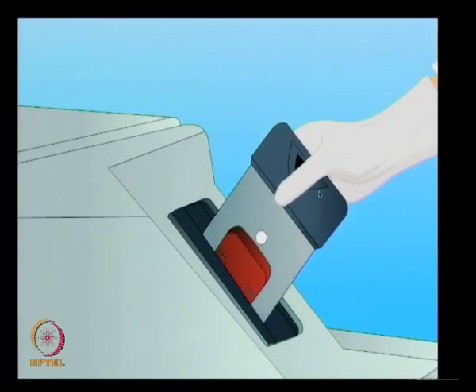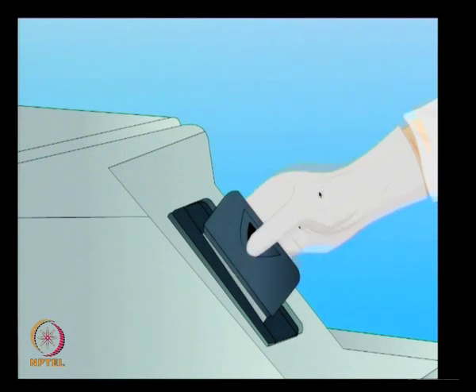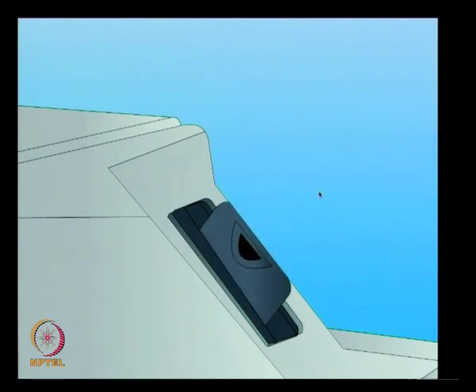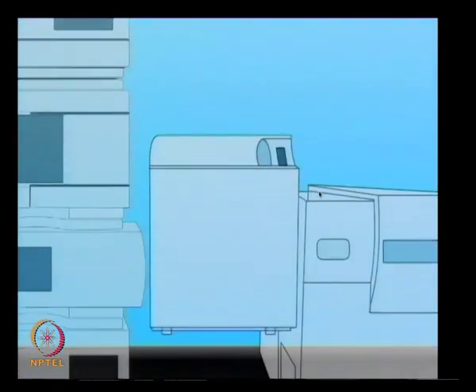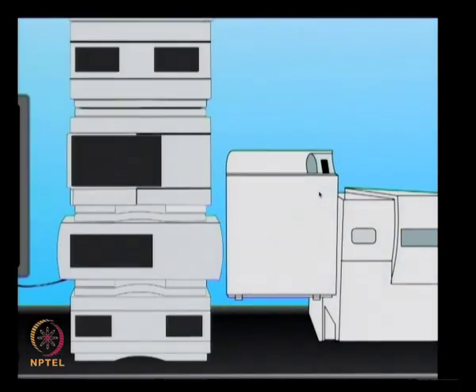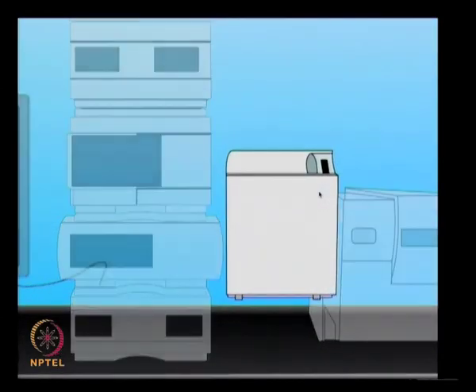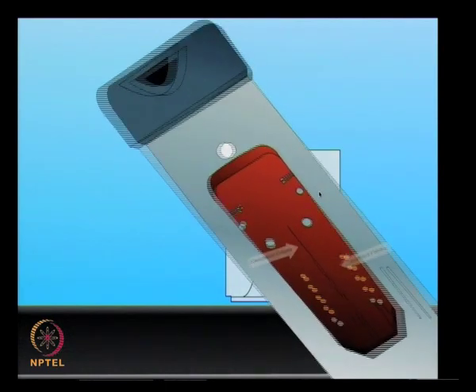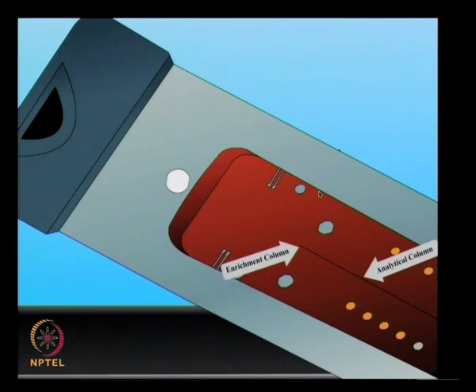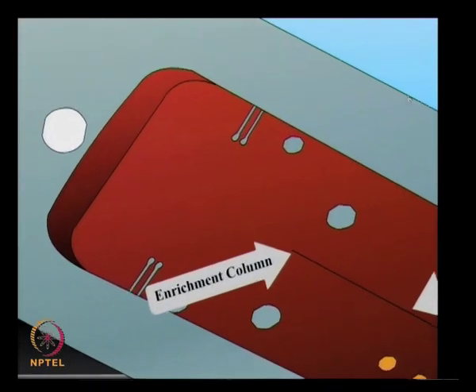The microfluidic device contains circuits of tiny closed channels and wells which are etched onto a glass or plastic microchip. Different forces such as pressure or electrokinetic can push a small volume of fluids in a defined manner.